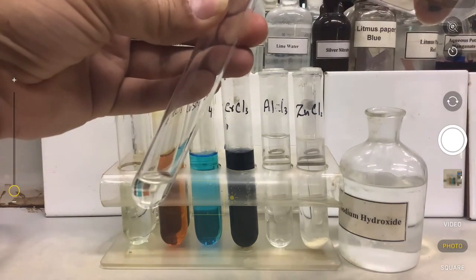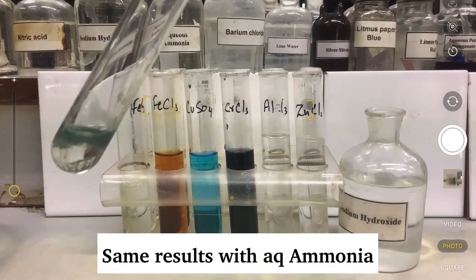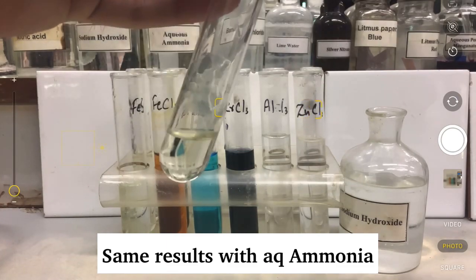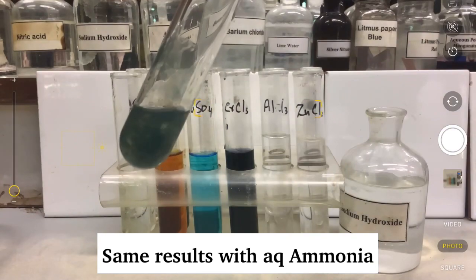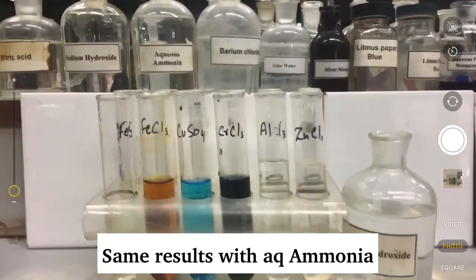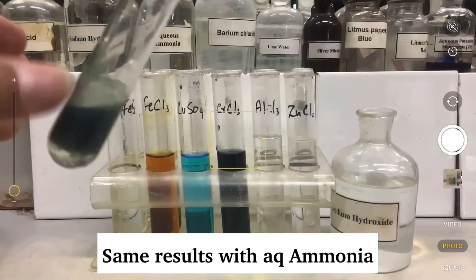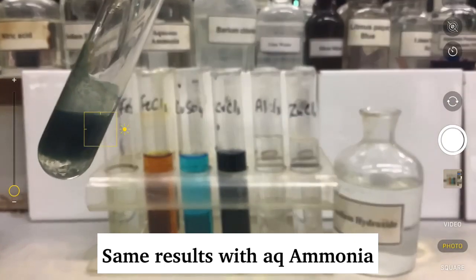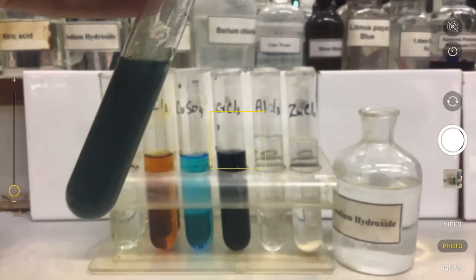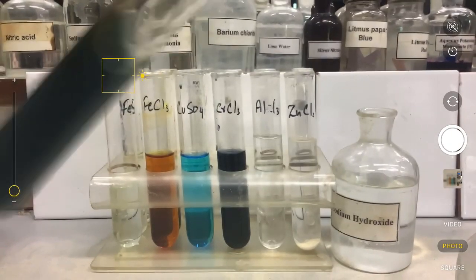You add drop by drop, and you see that the same kind of green precipitates are made when you added drop by drop aqueous ammonia. If you continue to add aqueous ammonia in excess, you will see that the green precipitates formed are insoluble in excess. This shows us that iron 2 ions were present. And what is the identity of those green precipitates, by the way? This is actually iron 2 hydroxide made, because ammonia was also an alkaline solution.